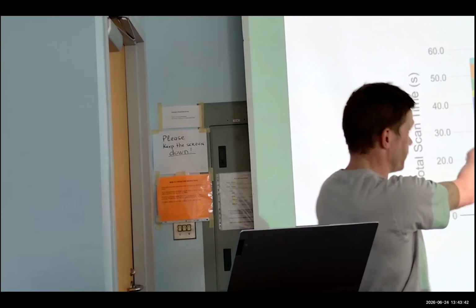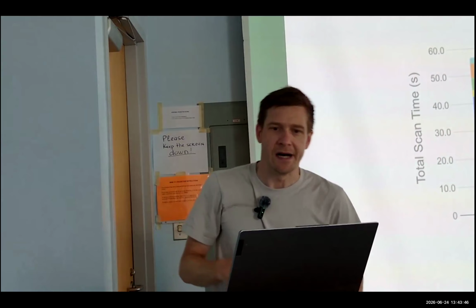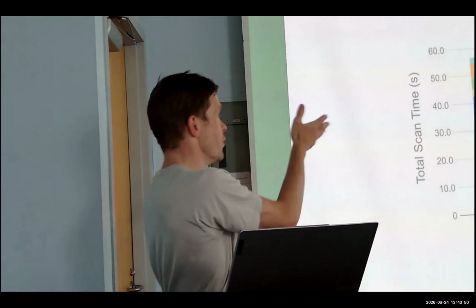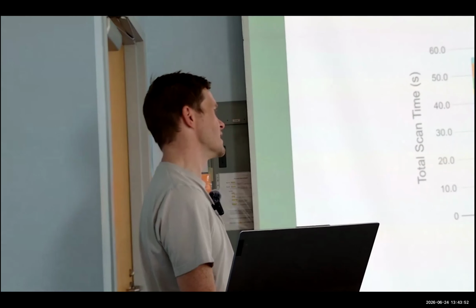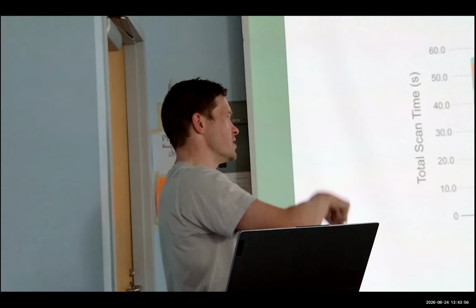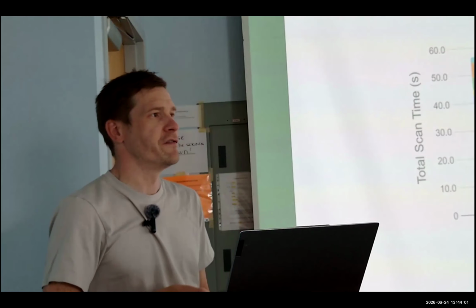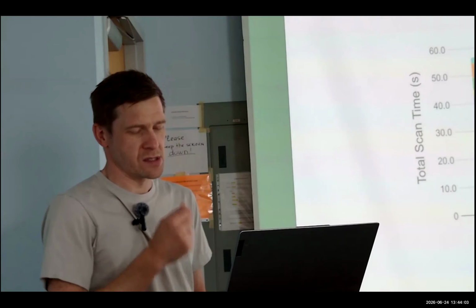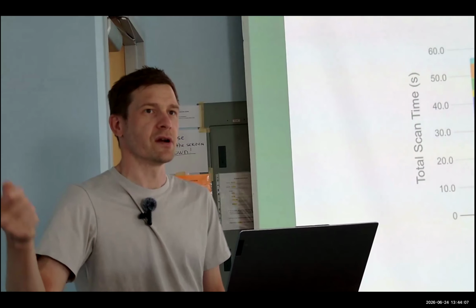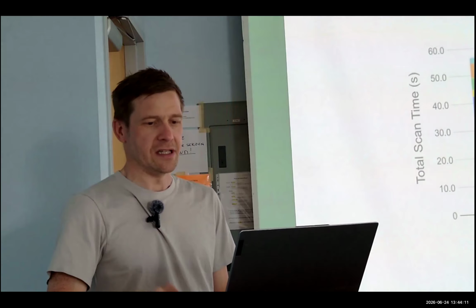And then optimizing the actual motion trajectory and motion profiles gave a huge boost to the speed. So there really are very significant gains to be had. We cut the total imaging time, with the same number of images and the same exposure time, almost in half. So it really is worth spending a bit of time. If you have a large data set you're trying to collect, why spend longer doing it than you need to?